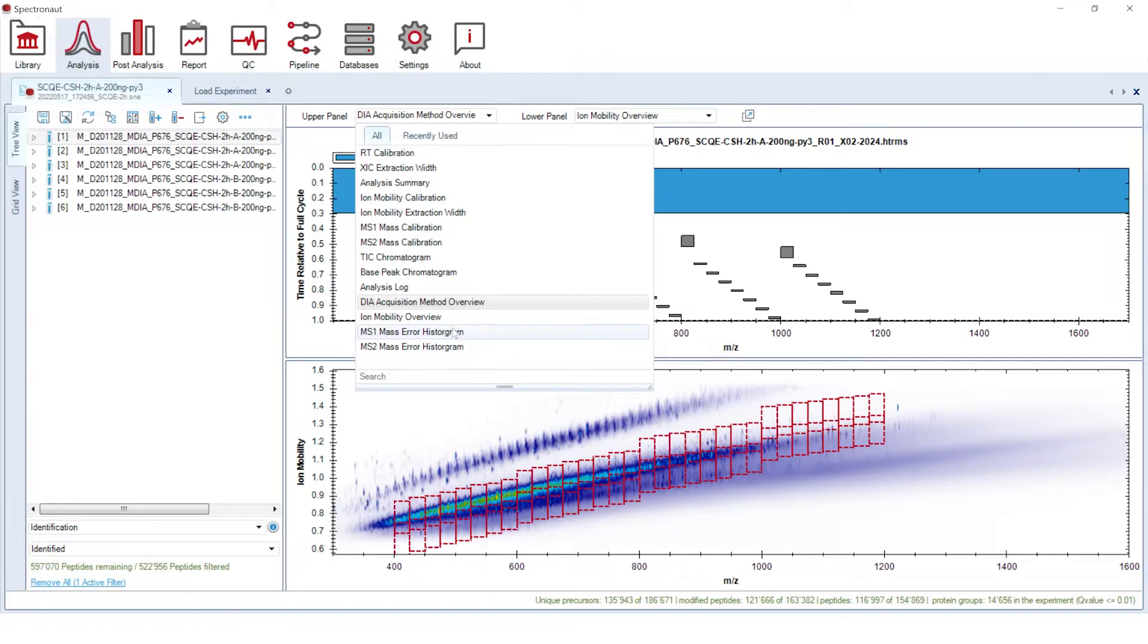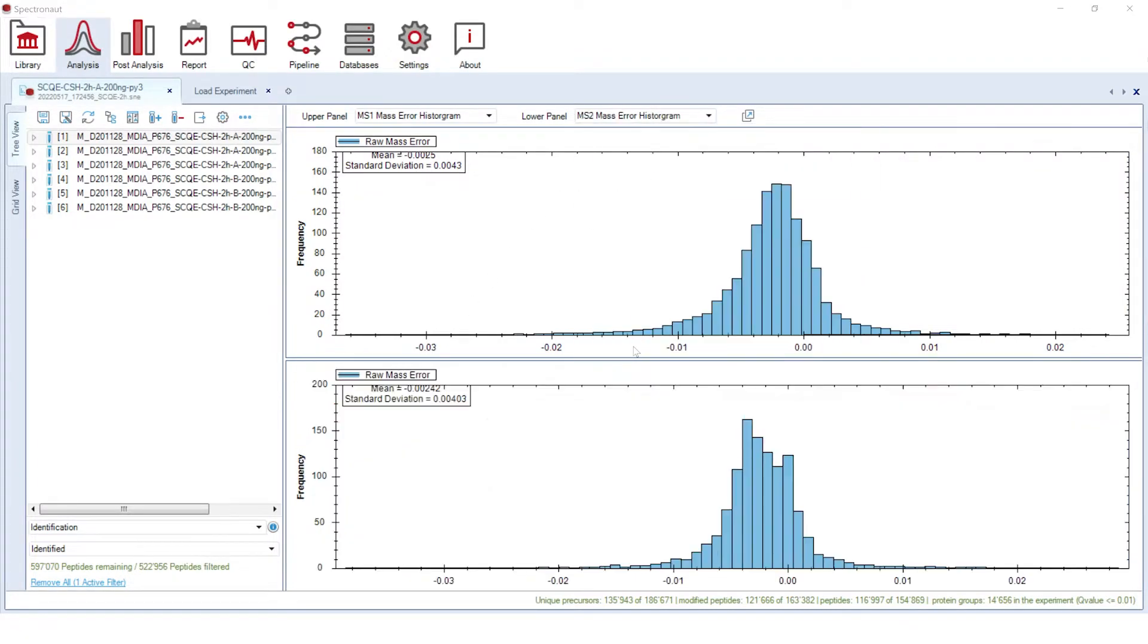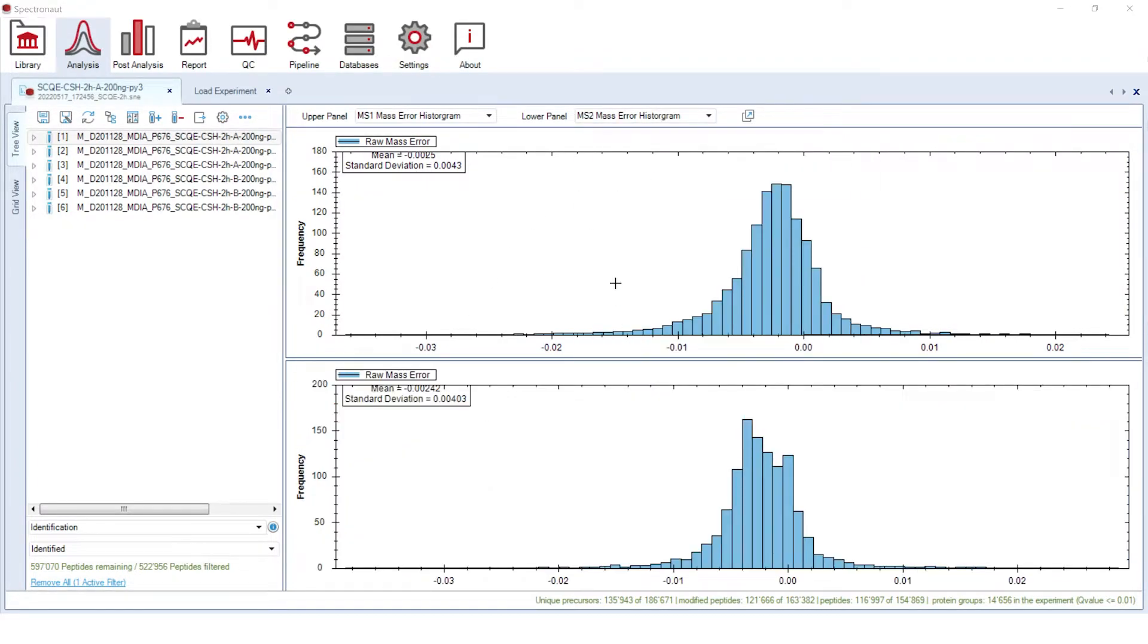Another new addition to the analysis review on the run level is a mass error histogram at MS2 and MS1 levels, which could be used for data quality control and mass spectrometer behavior monitoring.